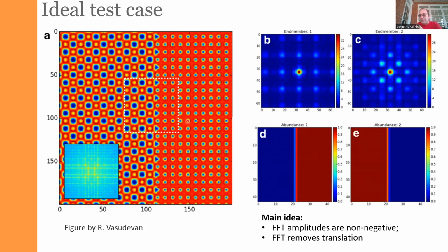When we use a machine learning method for analysis of this data, it doesn't give us something that is obvious for us because it's not obvious for the algorithm. The algorithm gives us the result, and we use our prior knowledge to conclude whether this result is explainable or not. In this case, it turns out that the result is so good that it is almost obvious. The algorithm has clearly identified this phase and this phase, and it gives you the right Fourier transform for this one and this one. You can ask me, but how do we know what is the right number of components? If we use techniques like k-means, Gaussian mixture model, BLU, or N-FINDR, we need to specify the number of the components.